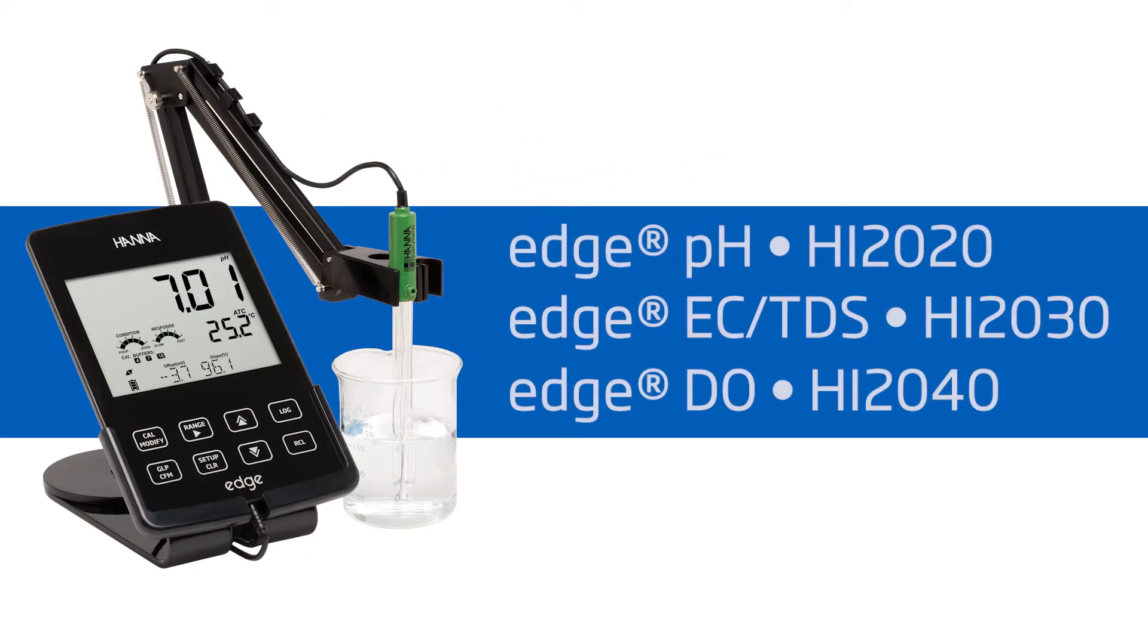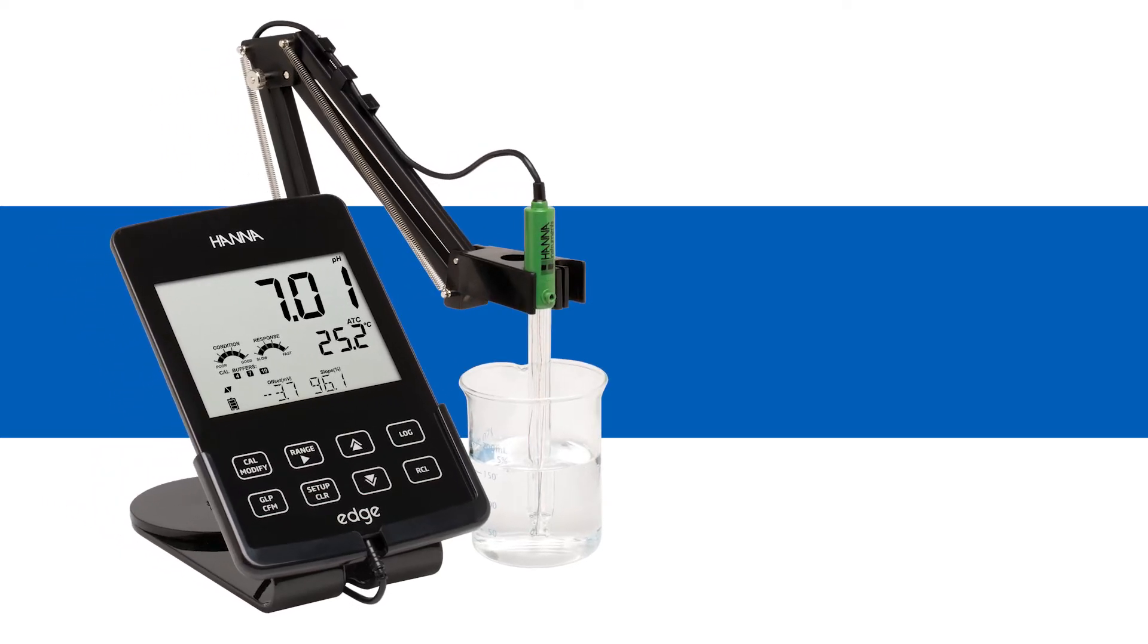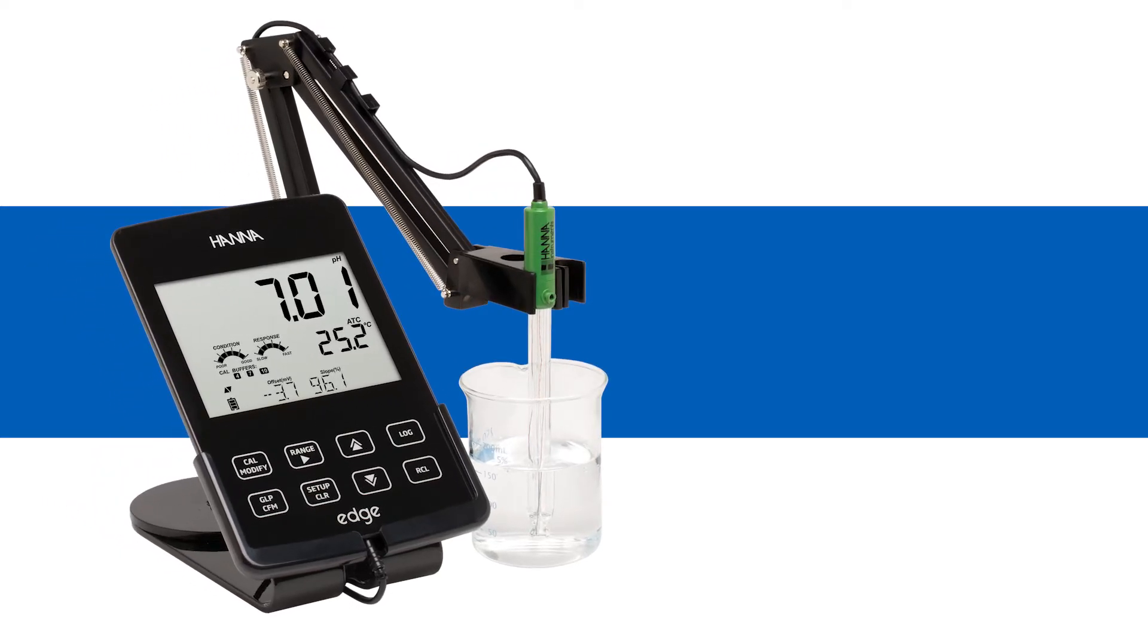Perfect for lab use, this advanced meter measures three different parameters: pH, EC/TDS, and DO, simply by changing the sensor. In this video, we'll go through the calibration process for each parameter.